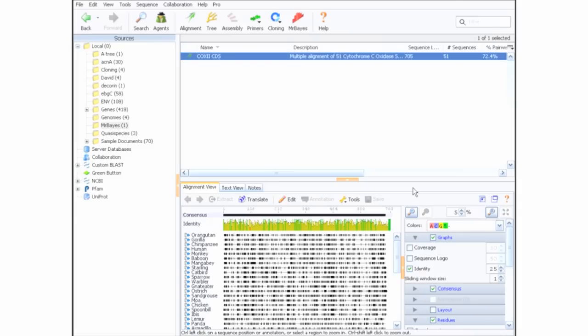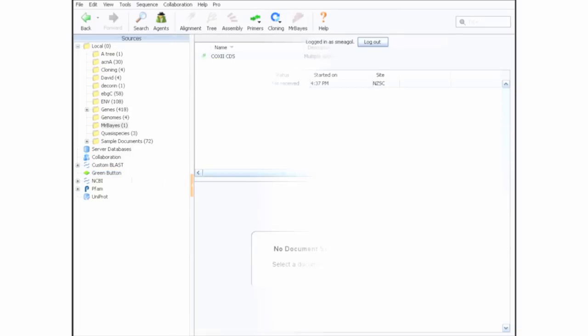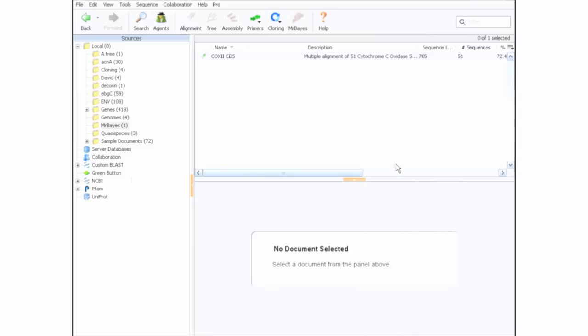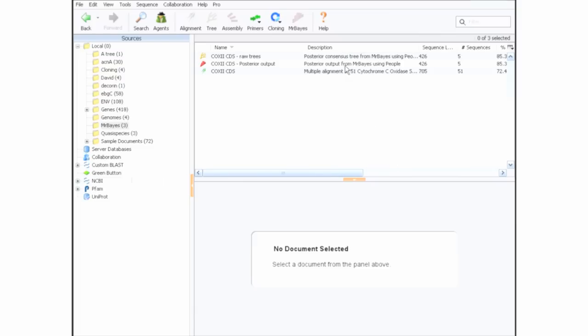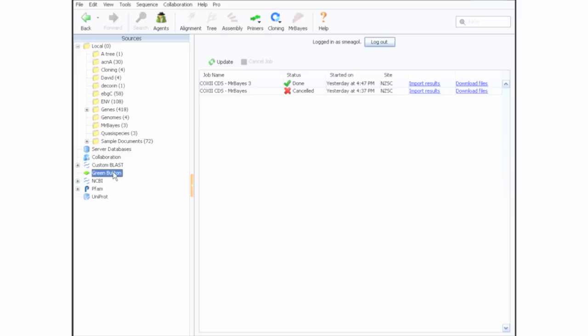Then you can click on Green Button in the Sources panel to see the status of your job. Once your job is complete, Genius will normally import the results automatically to the same folder as the alignment you used. You can also import the results or download the output files by clicking on the appropriate link next to your job in the Green Button Job List.